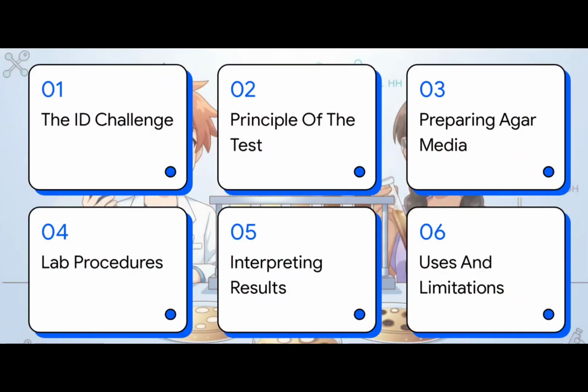Here is the roadmap for our explainer. 1. The Bacterial Identification Challenge. 2. Principle of the test. 3. Preparing the agar media. 4. Step-by-step lab procedures. 5. Interpreting test results. And 6. Practical uses and limitations. Let's get started.